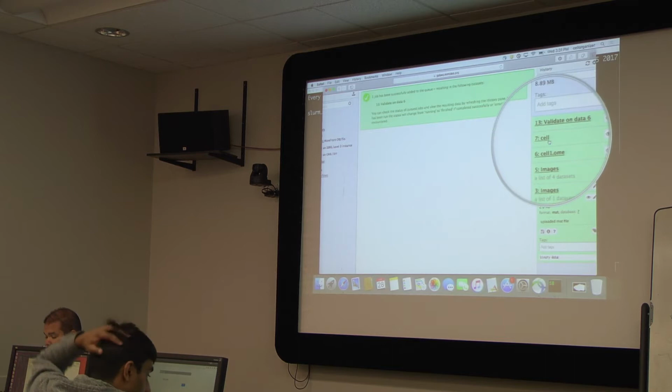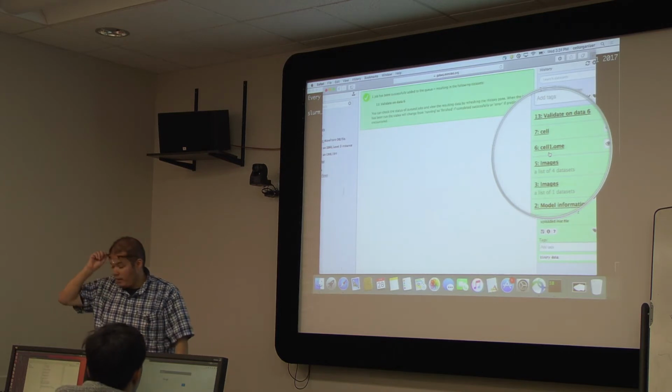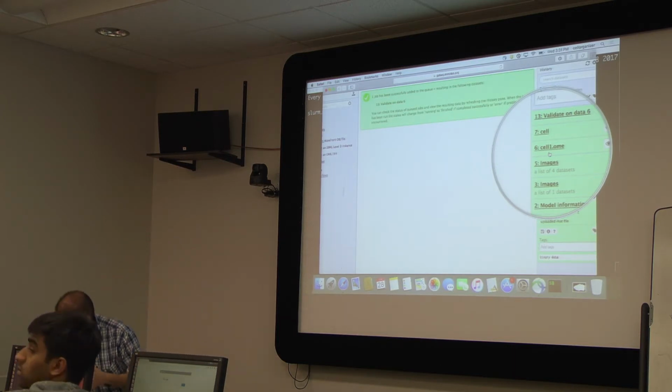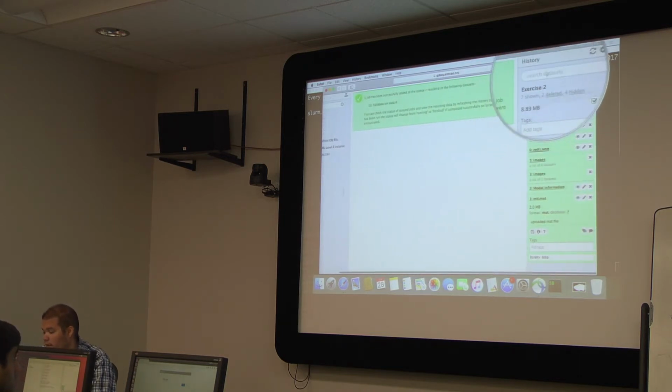So now, in a nutshell, you can synthesize images. You can synthesize any instance from any of our models, and you can generate the OBJ files that you can then import into CellBlender. Now, a few things that were not self-evident from this morning: the idea that we can use multiple files at the same time. The example is the following. I'm going to create exercise 3.